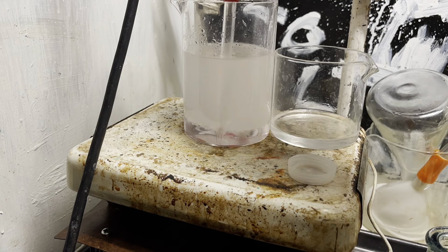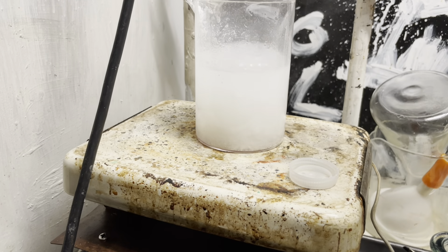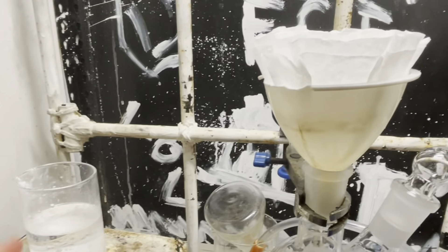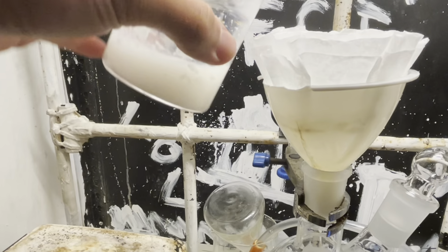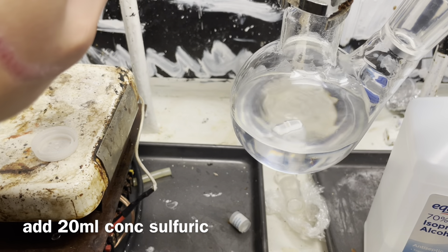Add a bit of sodium bicarbonate, stir it, and discard that as well. Add a bit of magnesium sulfate to dry the toluene off, and it looks very pretty. Now we're going to filter the toluene into a flask, and it should be methylthiophene-free. It was not.